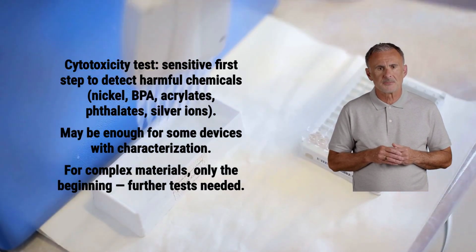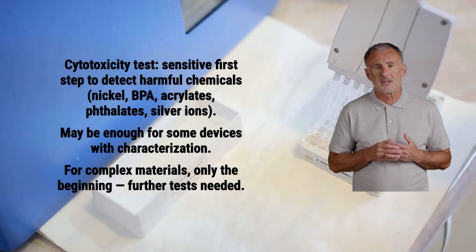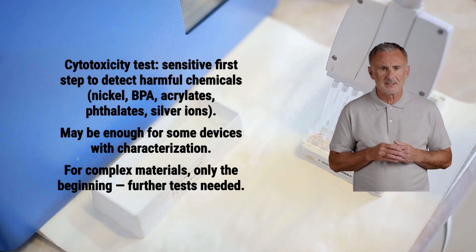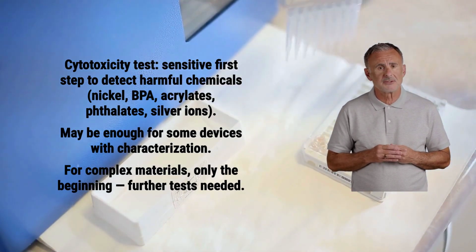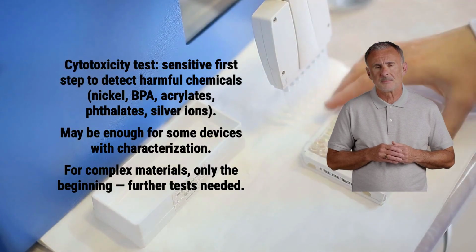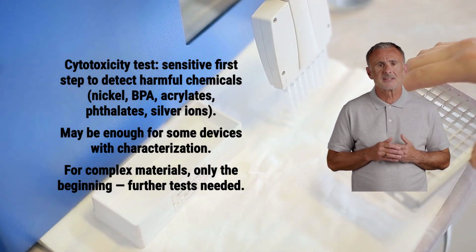But is this enough? In reality, although cytotoxicity testing, combined with characterization, may be sufficient for some devices, for many others with complex materials, it is only the beginning. To fully assess a device's biocompatibility, further tests are needed. In the next slide, I will discuss the limitations of the cytotoxicity test.